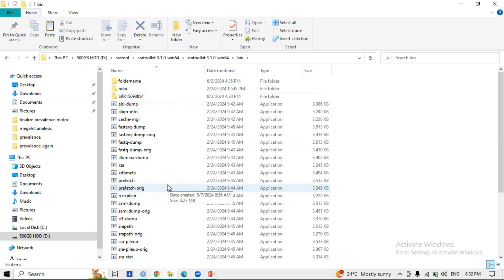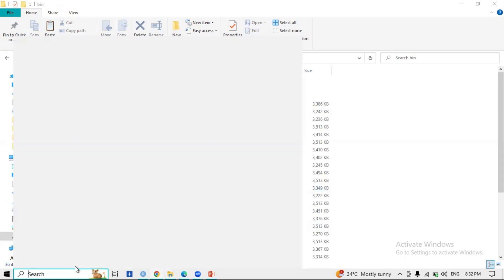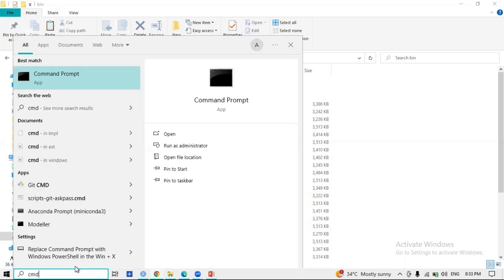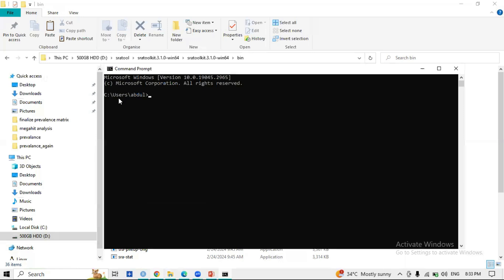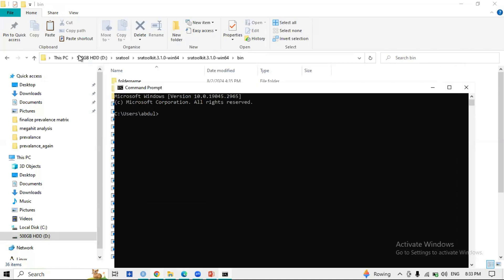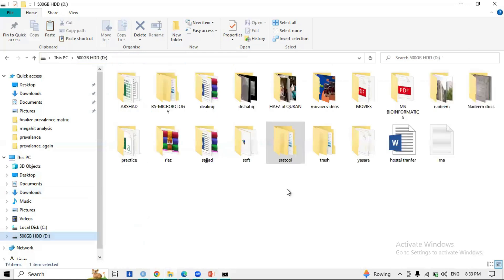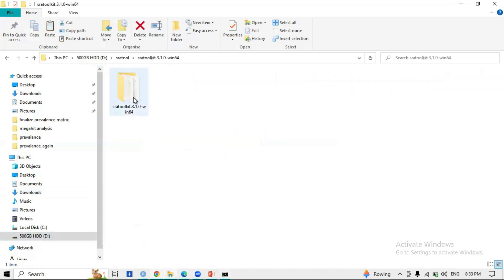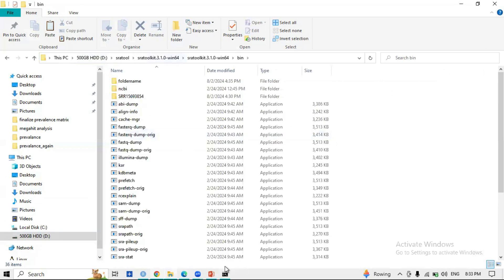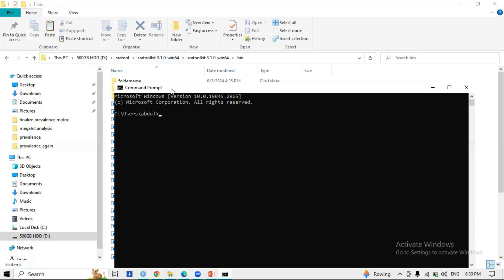Now I am opening Command Prompt. Many viewers may be new to Command Prompt, but I will teach you in a very basic way. When Command Prompt opens, it is navigating in the C drive by default, but my SRA Toolkit is in the D drive. Inside the D directory there is a directory called 'sra tool,' inside that is 'sra toolkit 3.1.0,' and inside that is the bin folder.